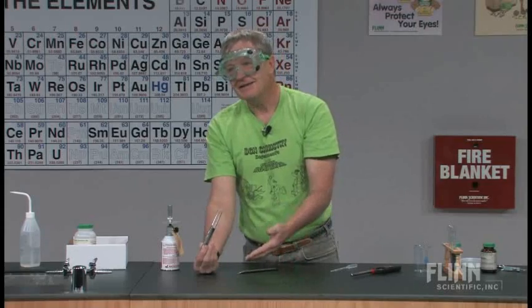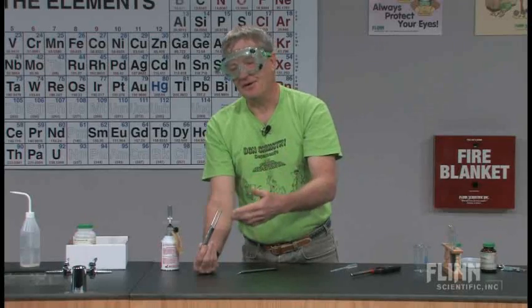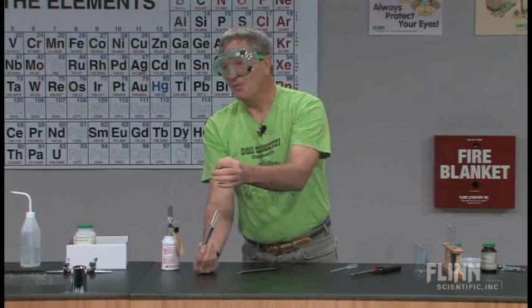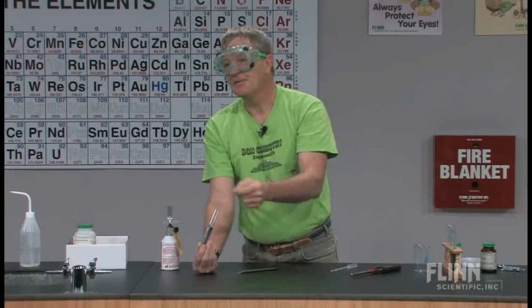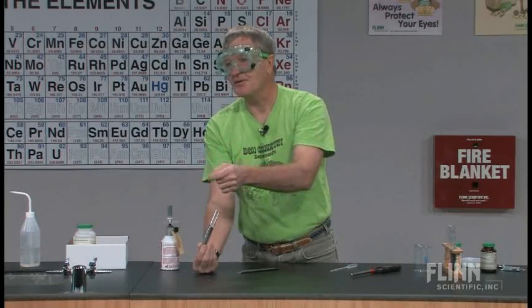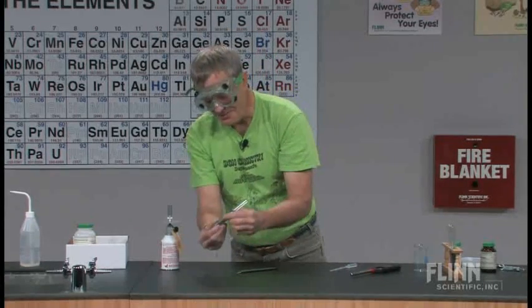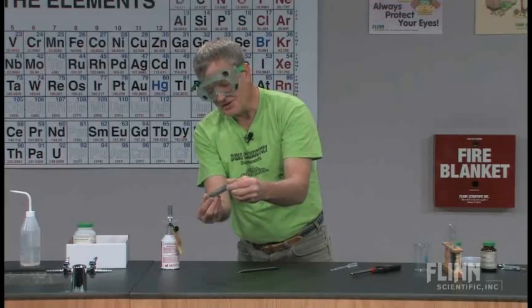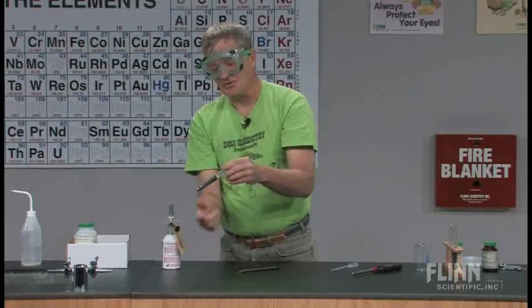And in fact, not that it really matters because the percentage is minuscule, but actually a dirty crucible, one with silicon on the inside, is a better one to use than a brand new one because there's a little reaction going on there that you aren't accounting for in your lab write-up. So that's really amazing. So anyhow, this is kind of neat. And again, you can feel this, you can see it's cracked. This test tube is useless at this point in time. There's nothing you can do with this later on.